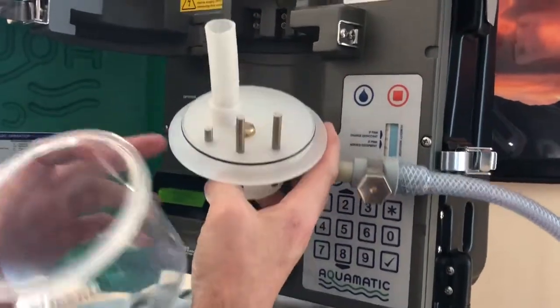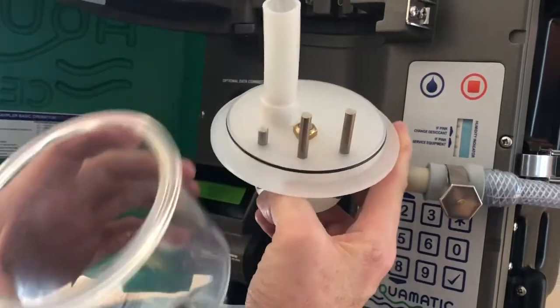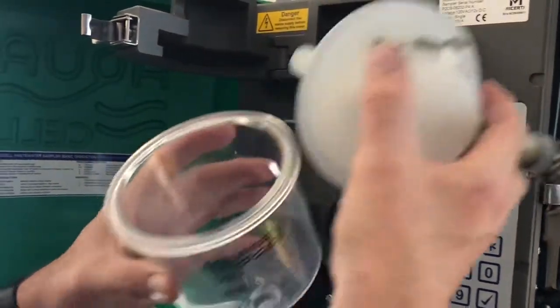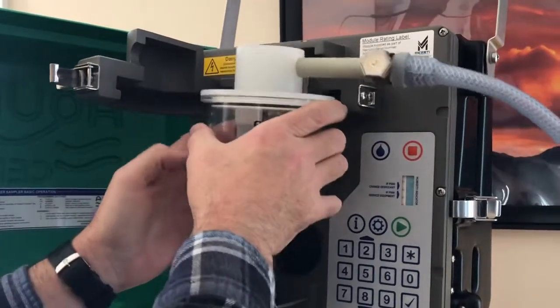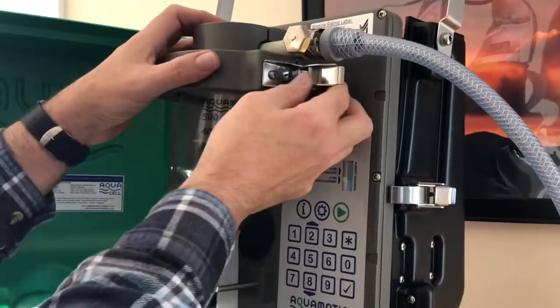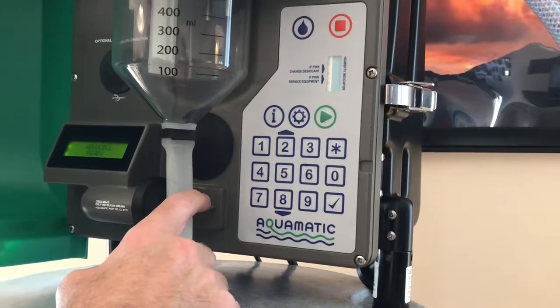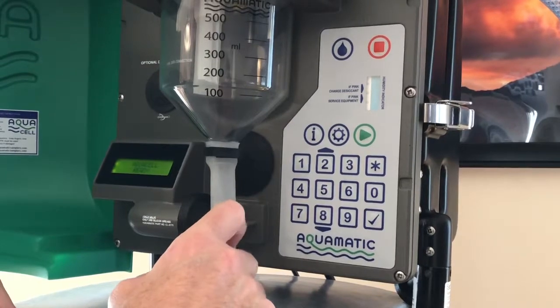This is the bottom of the sampler. You have your control rods as well as your emergency stop rod. Again, all this being done through vacuum. The vacuum connection is done right off the top. You'll see there the control points as well as the vacuum. The O-rings on these things last forever. I don't even know what type of material they're using for that, but it is long lasting. Got one of these in the field that's been doing it for about 10 years and absolutely zero failures. So programming it is done all through the keypad. It also will provide outputs, and in case that you would need to have a PLC hooked up to this, it has that as well as serial control.